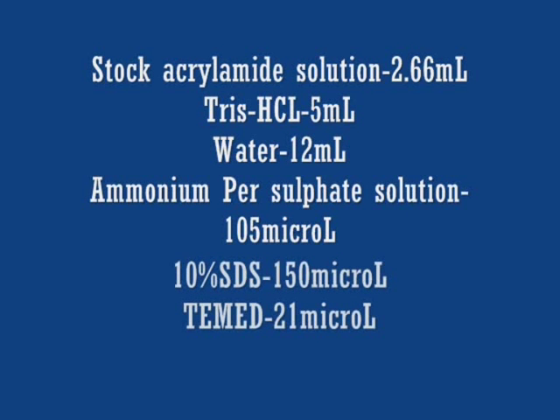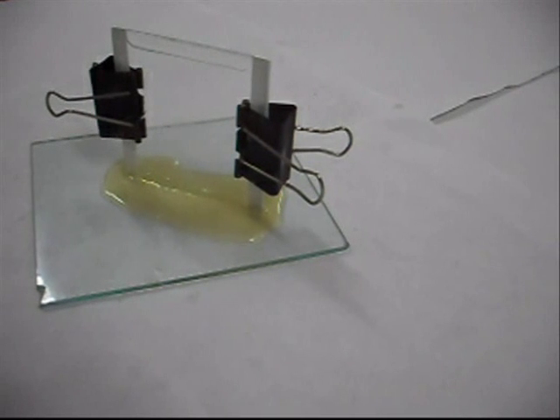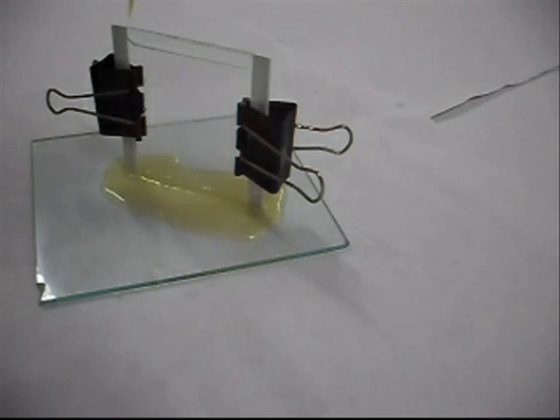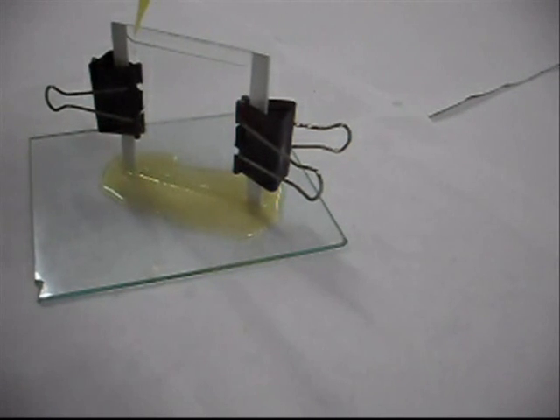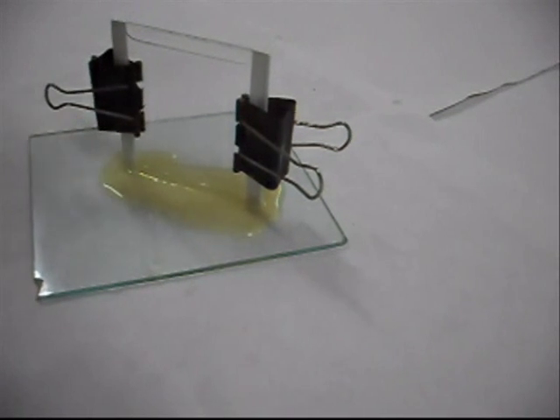The stacking gel is prepared with the following chemicals. The stacking gel is poured over the separating gel and the comb piece is placed immediately over it for well formation.